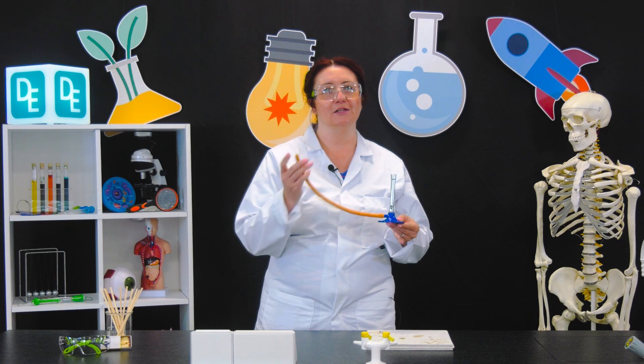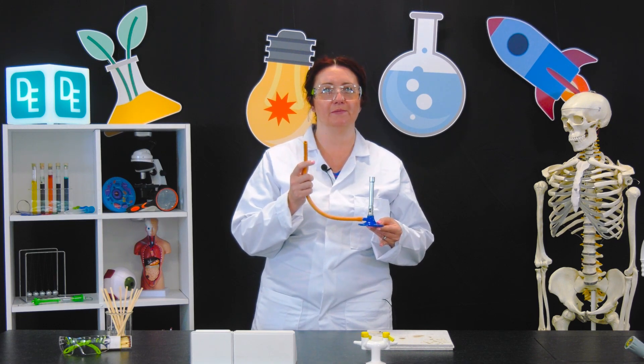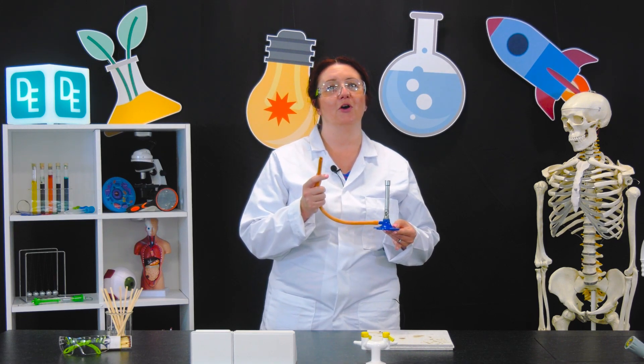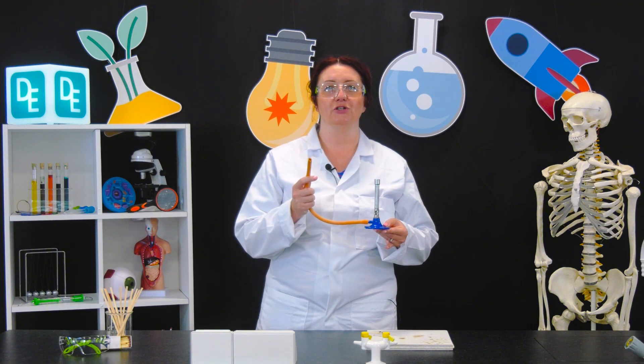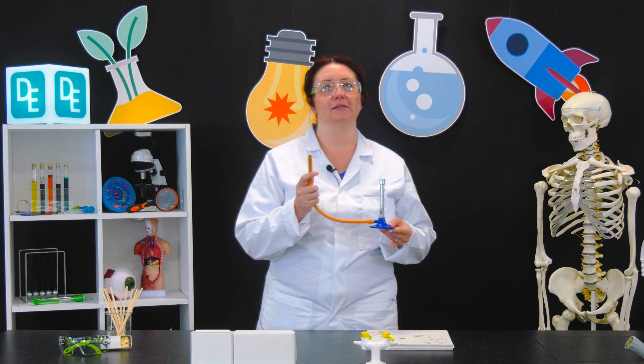First, connect the rubber hose from the Bunsen burner to the gas tap on your lab bench. Make sure it's snug and secure.